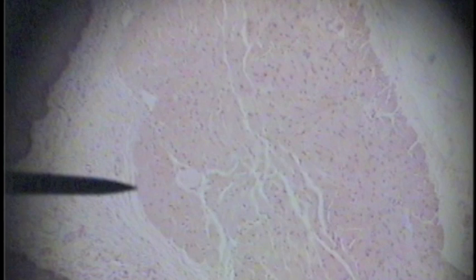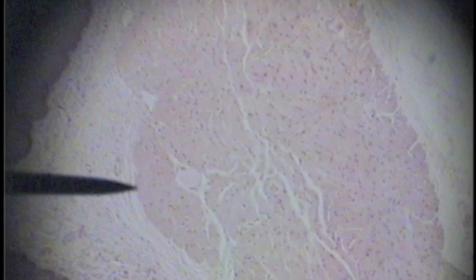Here the pointer is in the lamina propria of the esophagus. Now the pointer is at the muscularis mucosa of the esophagus. Tunica submucosa of the esophagus, and here the pointer is between the submucosa and the muscularis — tunica muscularis.